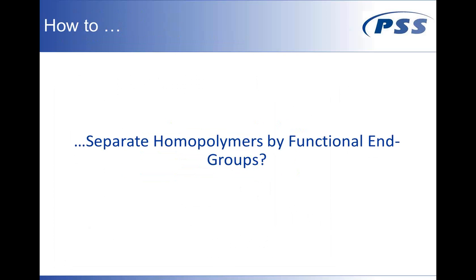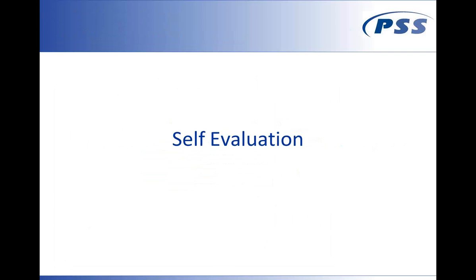So now we have all our tools together, and we can ask ourselves, how can we separate homopolymers by functional end group? And actually, this is what you have to answer now.